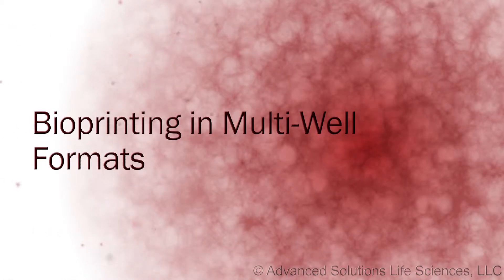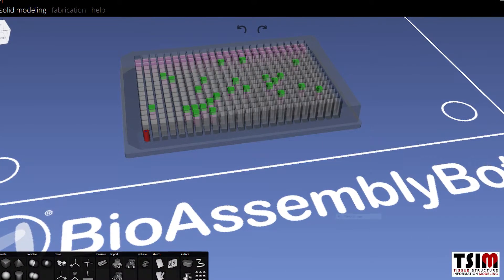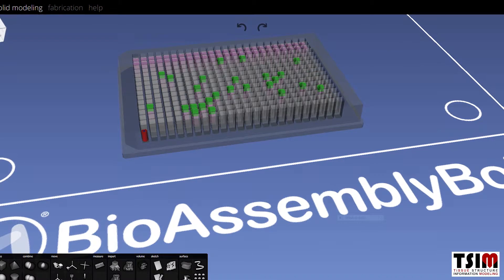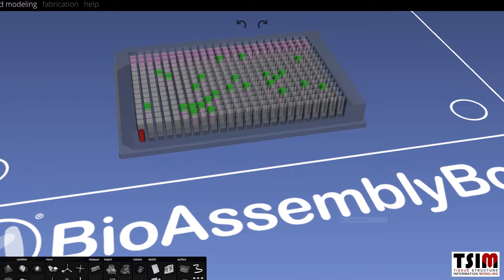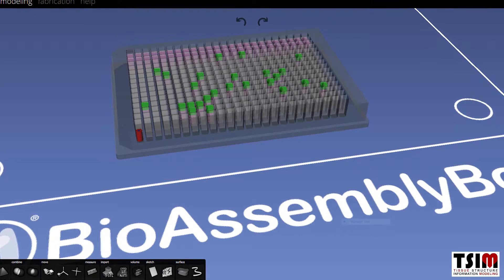In this example, we will be demonstrating the abilities of the TSIM-BAB system to create a number of different printed systems — cellular as well as hydrogel as well as matrix-based systems — in high-density well plates for a variety of research and screening applications.